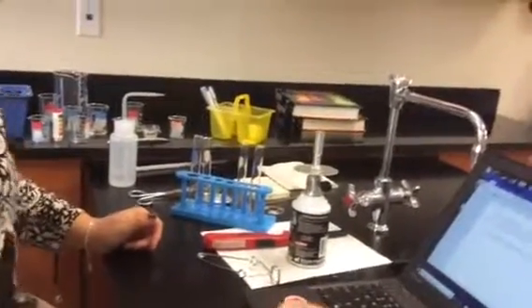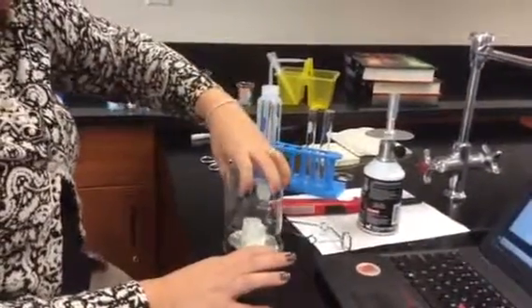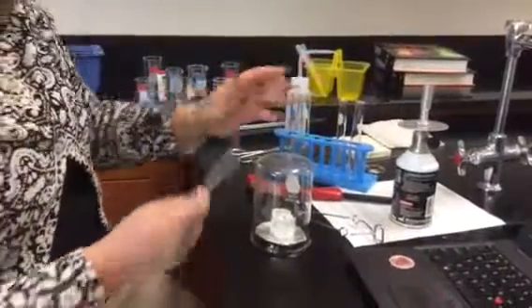Alright, what else? Place a candle, so you have where you did your magnesium ribbon. Place a candle on top. Alright, you're going to light the candle. You're going to put this over the candle. You're going to wait for whatever to happen. You're going to light a splint, which is this. Light, light, light. Once everything's happened, you're going to put this underneath here like that. Alright.